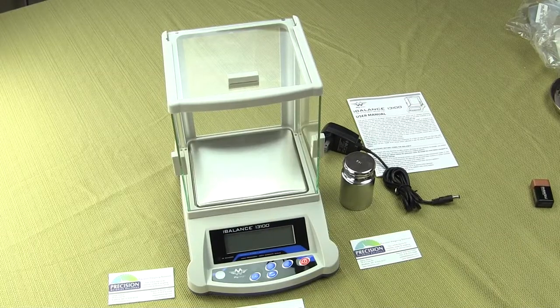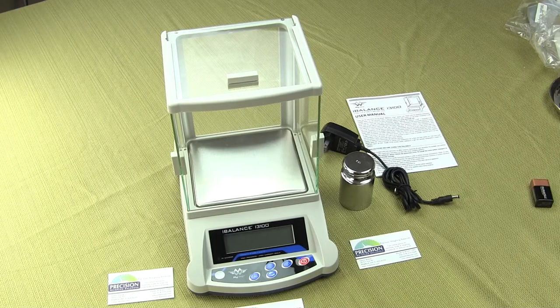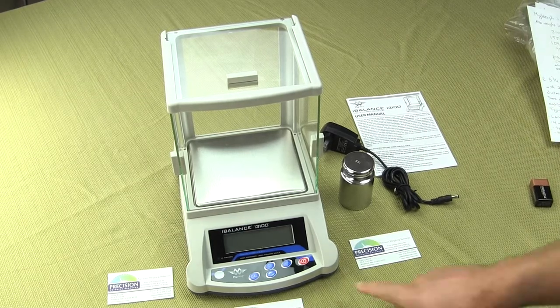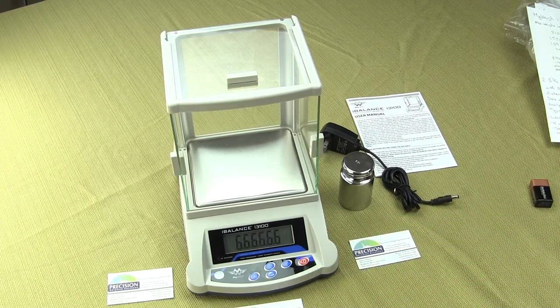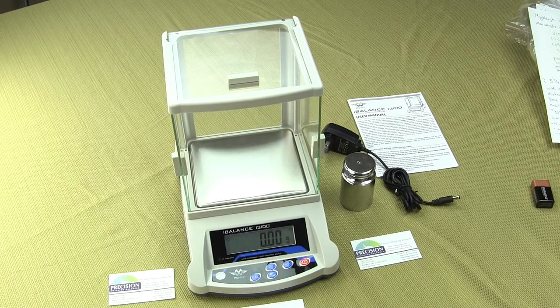In this video we'll be showing you the MyWay i3100 digital scale. This is a brand new scale from MyWay — very nice and affordable. You're going to get 3100 grams by 0.01 gram. The scale also has four weigh modes: carats, ounces, troy ounces, and a parts counting mode.